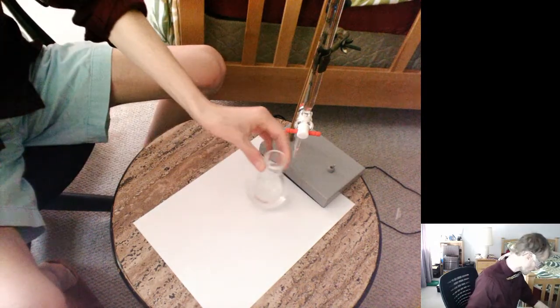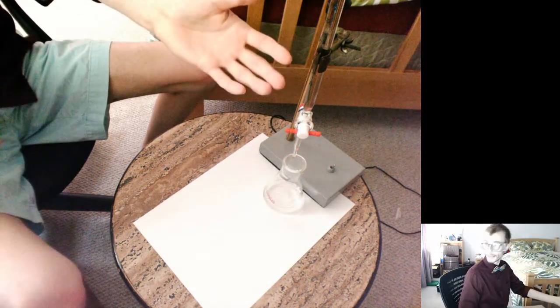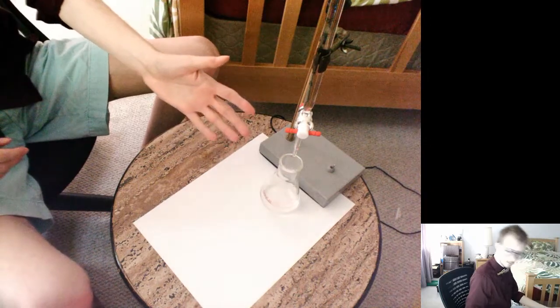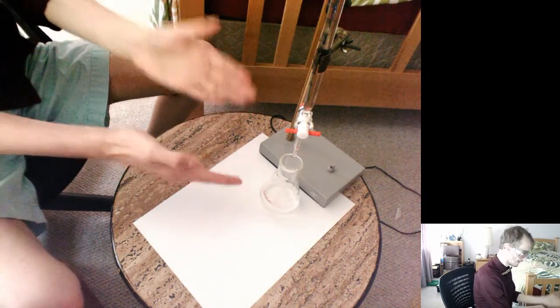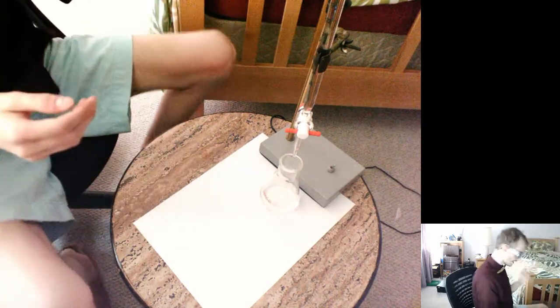So I have it here underneath my burette. Now my burette is sitting at 0. You guys can't see, but at the top of the burette it measures 0. So I'm going to be dripping out slowly some volume of base until it neutralizes the acid inside the acid container, and then turns the phenolphthalein the color pink. So we're going to go ahead and do that.